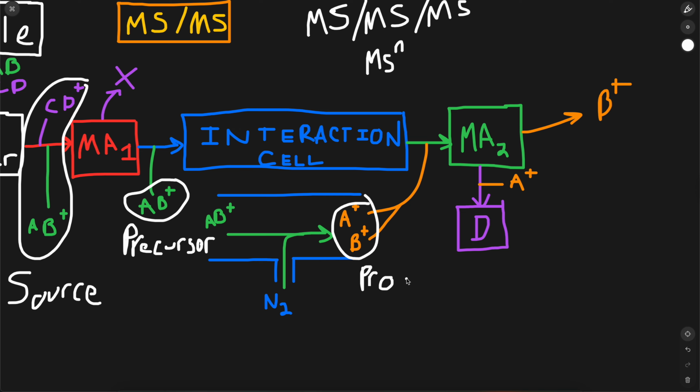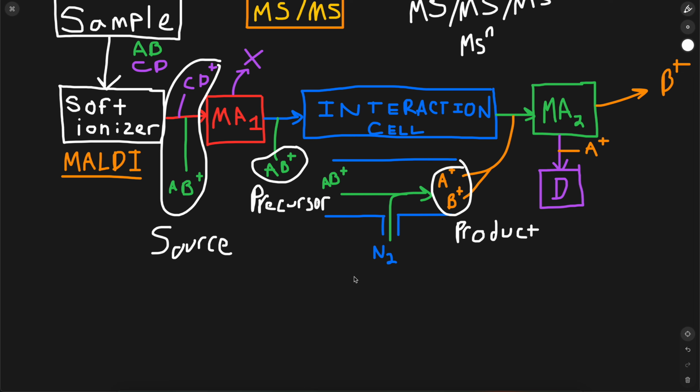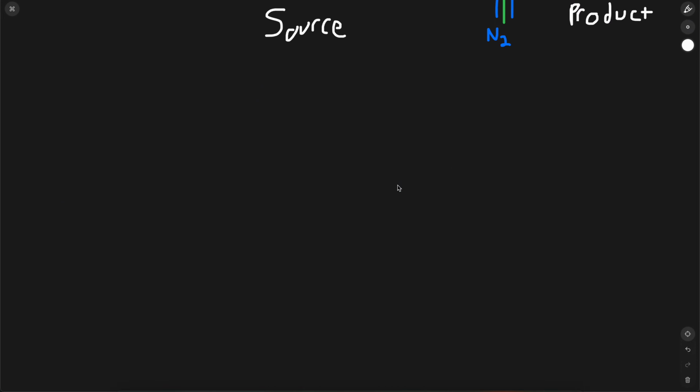Okay, so these are product ions. So keep that terminology in mind for when you might read some literature on Tandem MS or any of these other MS kind of ideas. Okay, so let's talk about two specific setups. We're going to talk first about QQQ.